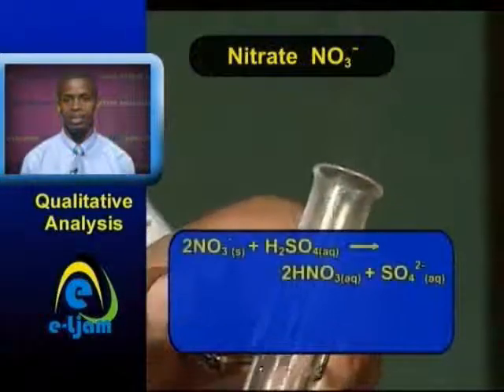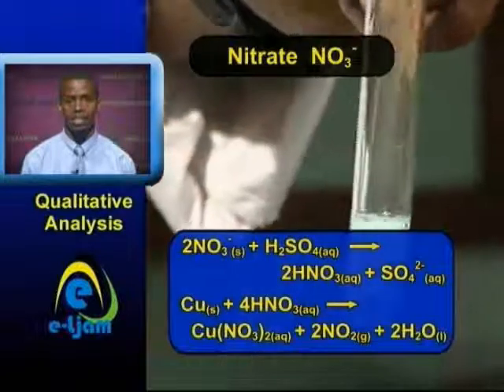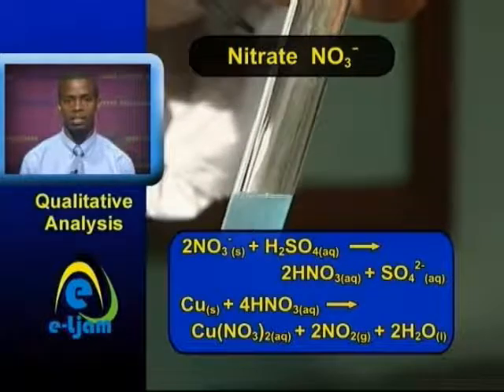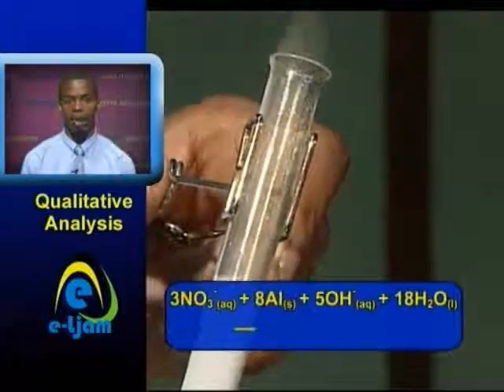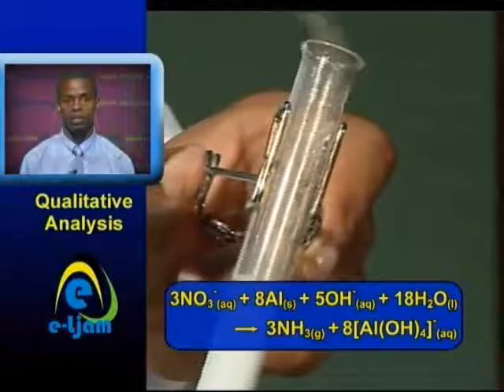Nitrate. The solid decomposes with the evolution of nitrogen(IV) oxide, and the solution turns blue on addition of concentrated sulfuric acid and copper turnings. Ammonia is given off after the addition of aqueous sodium hydroxide and aluminum powder.